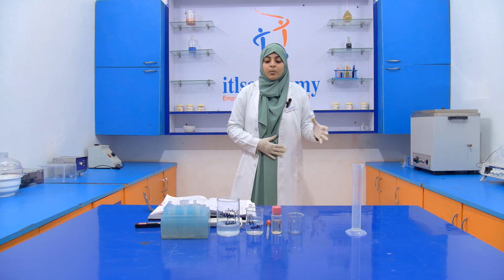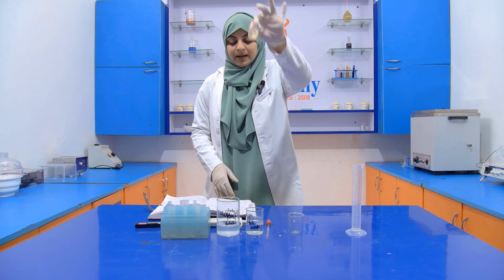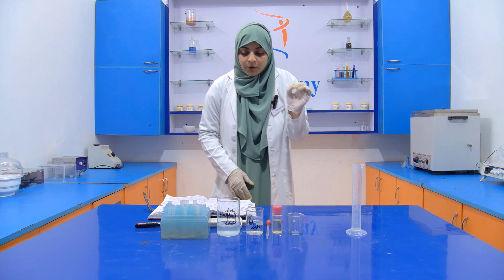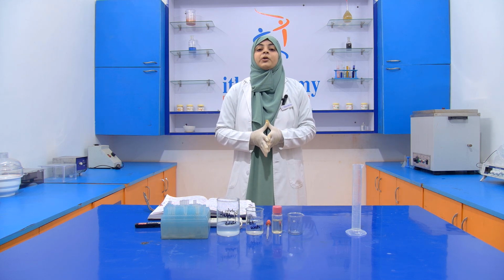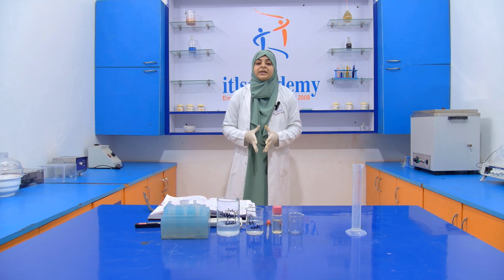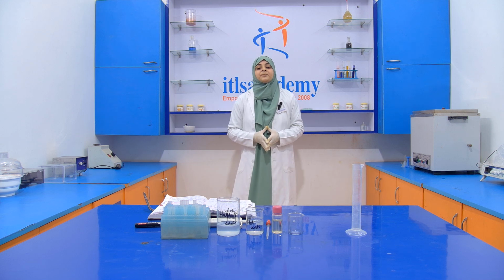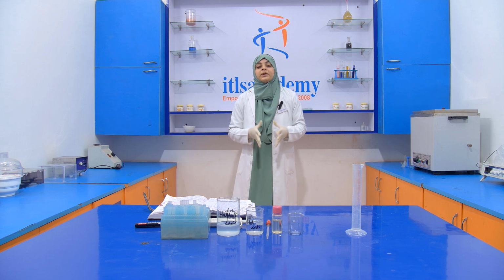Here we have a sample, that is oil, in which we are going to detect the cottonseed oil. Cottonseed oil contains trans fat, and we all know that trans fat is not good for the health of human beings. It causes cardiovascular disease, it raises the blood pressure. That's why it is very important to detect this.